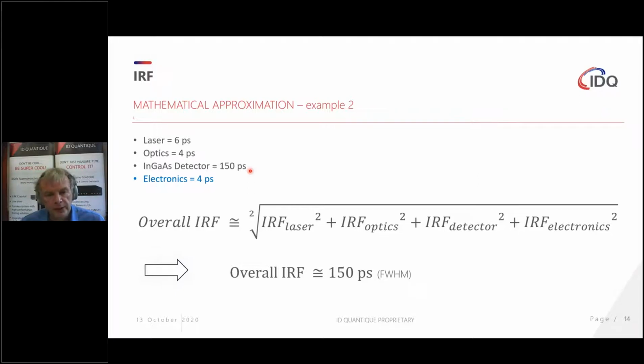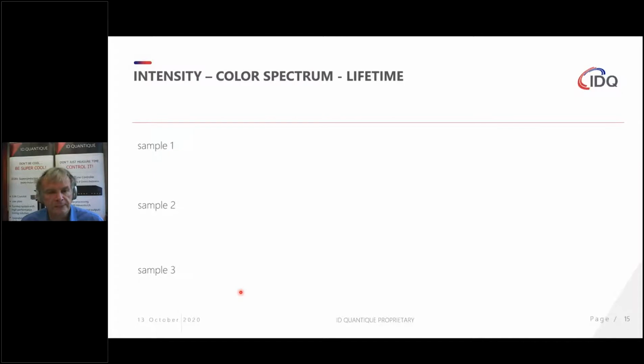If you use a pulsed diode laser, then your laser can actually be a limiting factor. This is all I want to say about IRF. If you have questions about it, please ask. We'll be happy to answer.